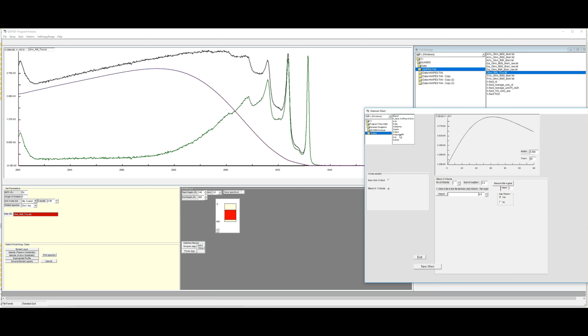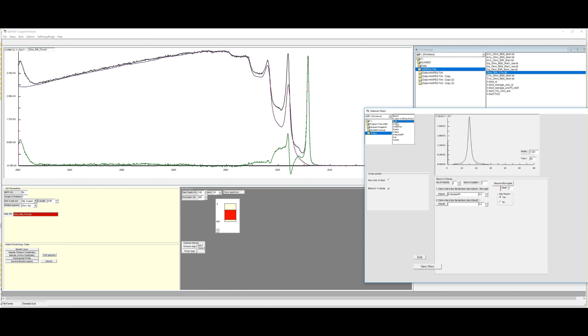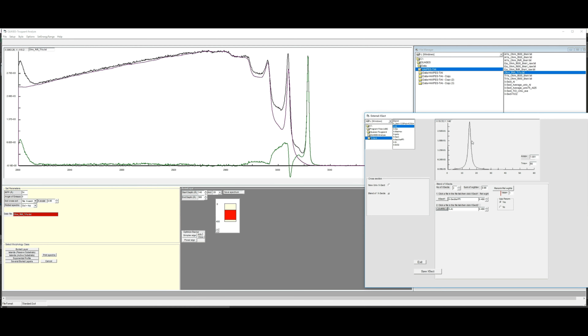in a separate experiment. So now we could try to make a blend of this cross section, which would be representative of the titanium layer, and blend that in with a cross section. I click here to have 2 cross sections. I click OK here, and then I load the aluminum cross section here. Because we have a layer of titanium, we have a layer of aluminum. To blend in these, we re-normalize these so we get an area 1 here. Cross section. You see the aluminum has a very sharp plasmon structure here, around 15, 16 electron volts.